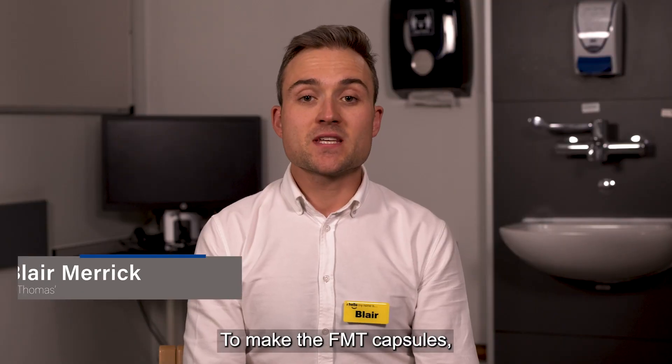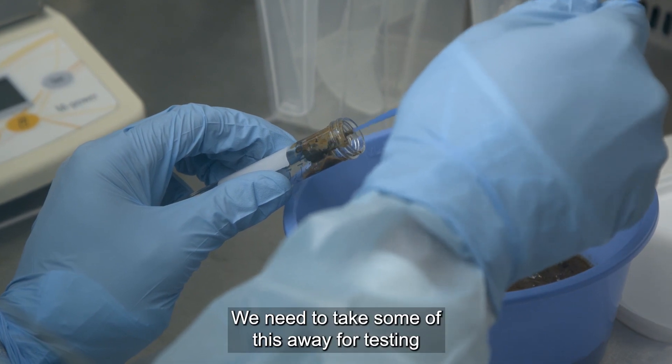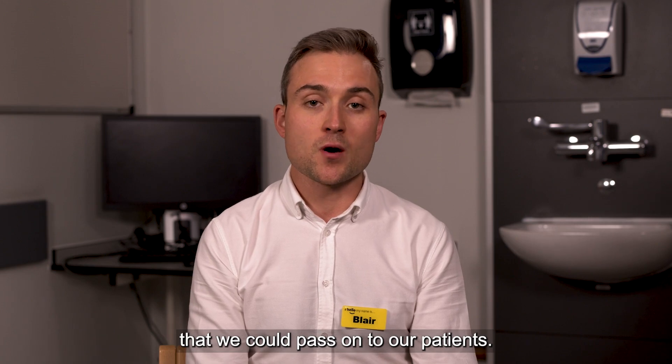To make the FMT capsules we first start with a donated stool. We need to take some of this away for testing to make sure there's nothing harmful in it that we could pass on to our patients.